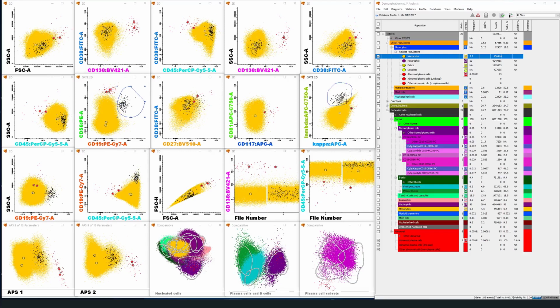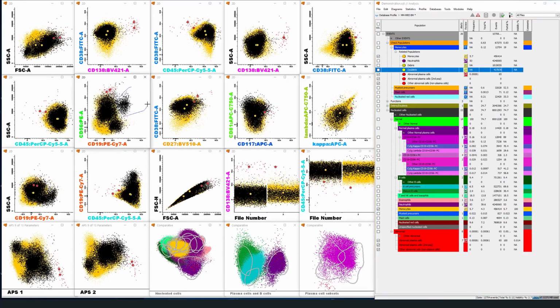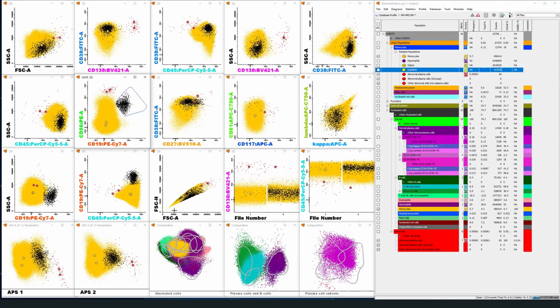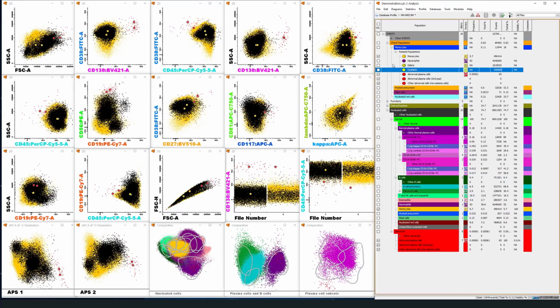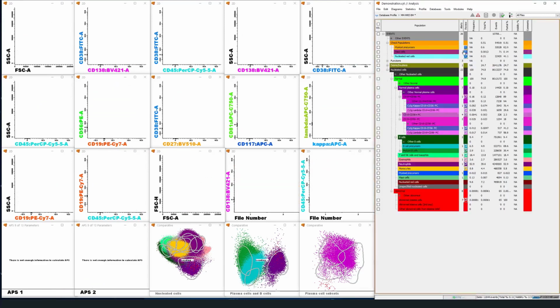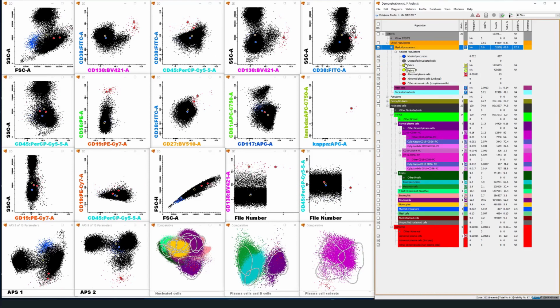So it seems there are some non-specific doublets or small populations that may be some kind of hindrance, but usually not a big problem. These appear to be doublets at least. And yes, the rest I'll just assign to monocytes. Myeloid precursors may be of interest if there is a large increase of them, which may happen in some specific settings of treatment, or you can have secondary increases or secondary leukemia, but that's pretty rare in most cases.